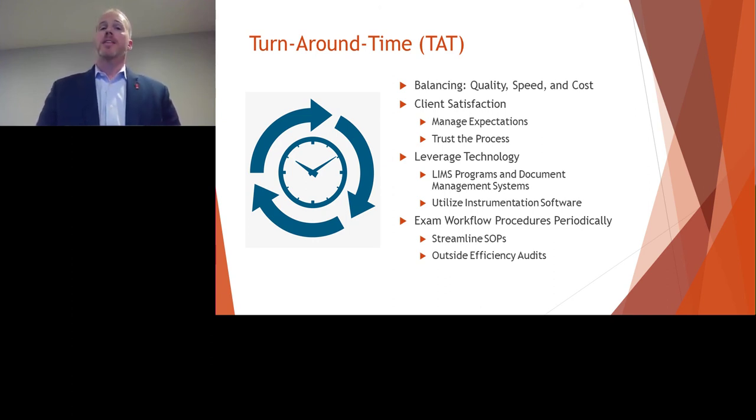And then the other big thing is to utilize your instrumentation software. I've looked at a lot of different labs and talked to a lot of individuals, and they are not utilizing their instruments to their fullest potential. They're trying to do a lot of manual work, stepping outside of what the instrument can be doing for them.